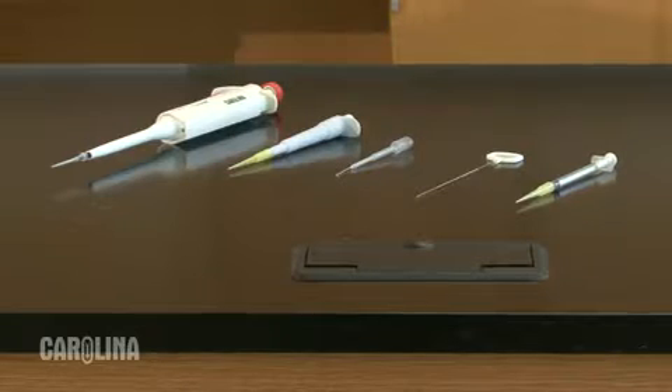Today I'm going to show you how to load a gel as part of doing electrophoresis. How well you load the gel affects the quality of your final results. There are five devices available from Carolina for loading gels.